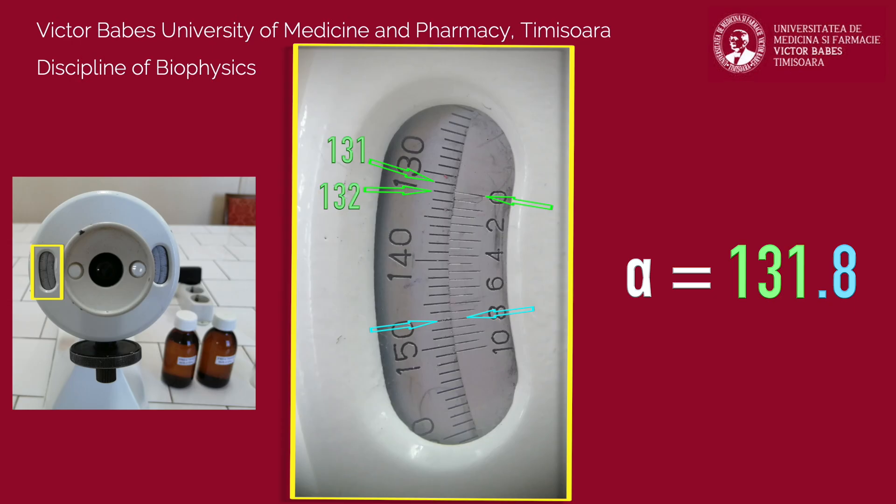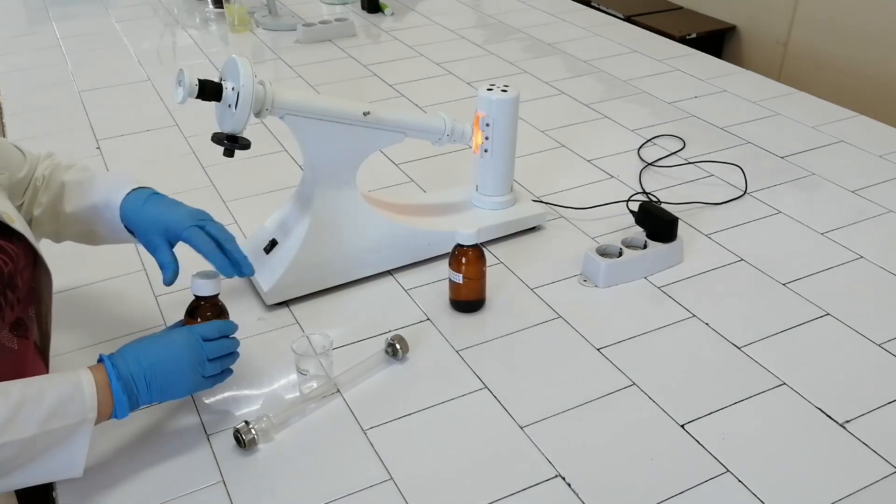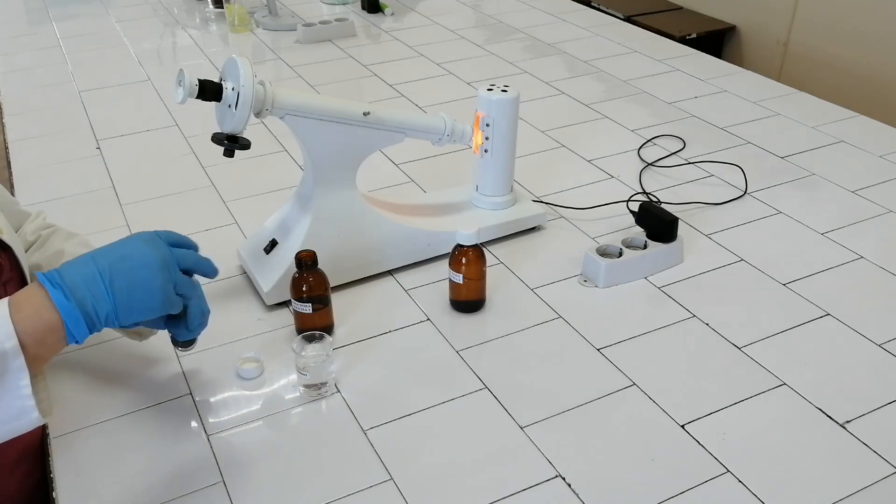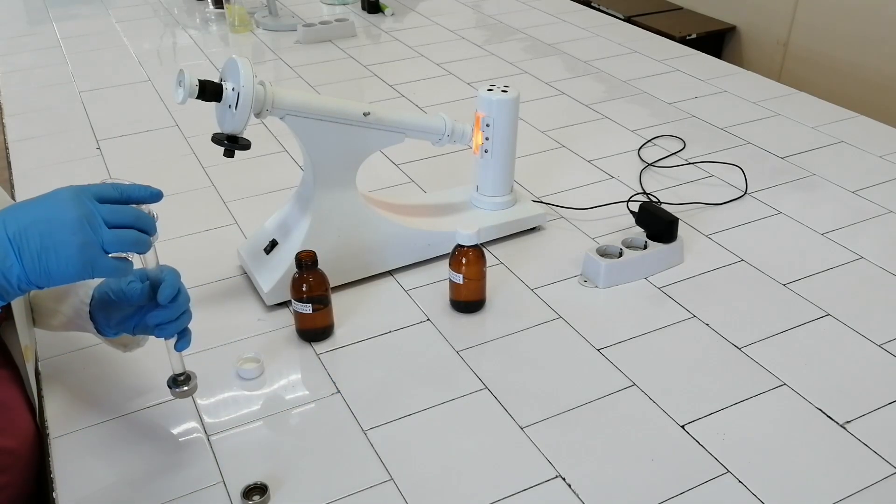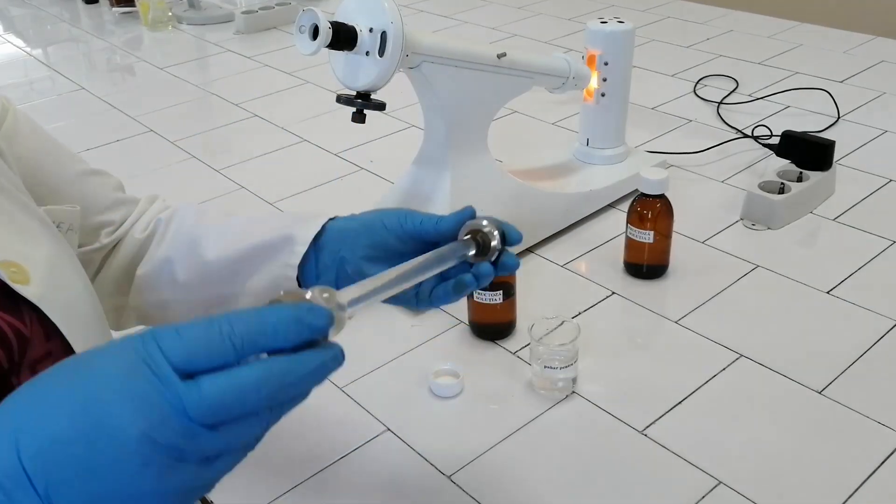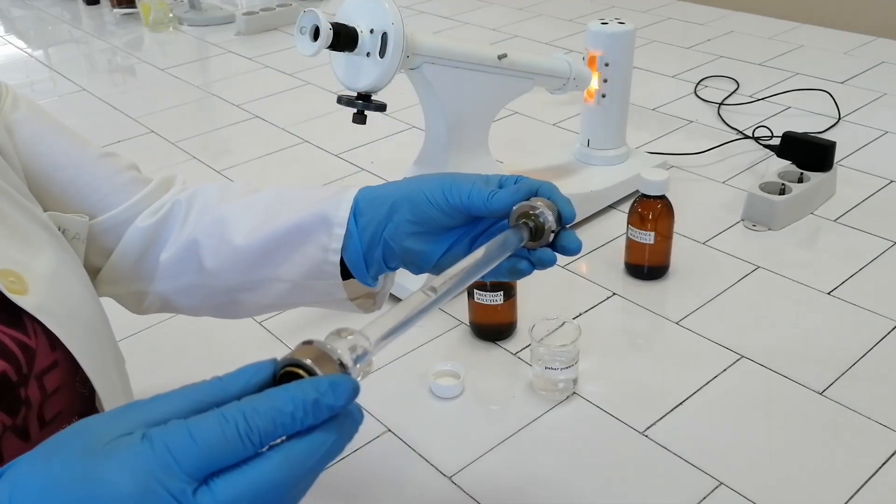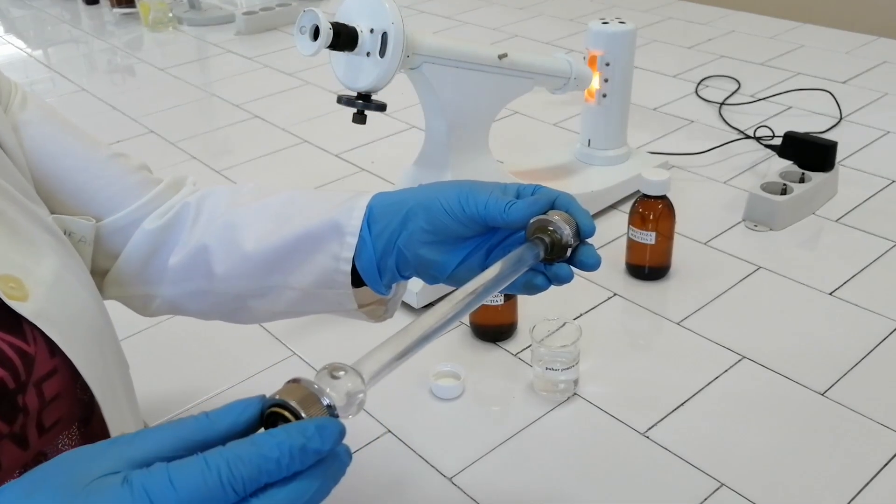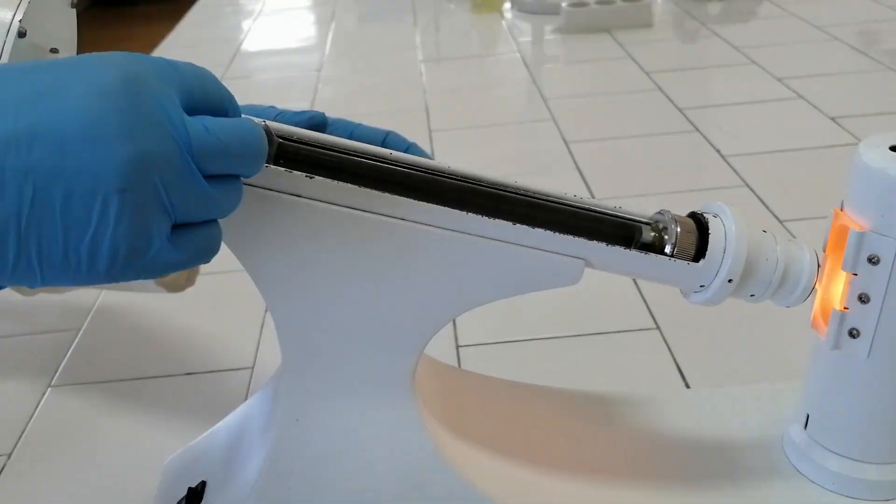Read the rotation angle for the empty tube three times and record the obtained values in the table. Then, consequently fill the tube with the two studied solutions to read their corresponding rotation angles. Fully fill the tube with studied solutions to prevent trapping of air bubbles inside. If a small gas bubble is found, make sure it is trapped on the area of larger diameter of the tube during the measurement.